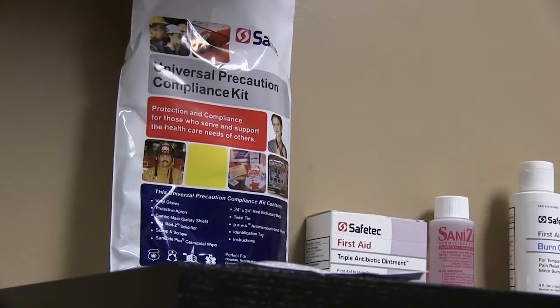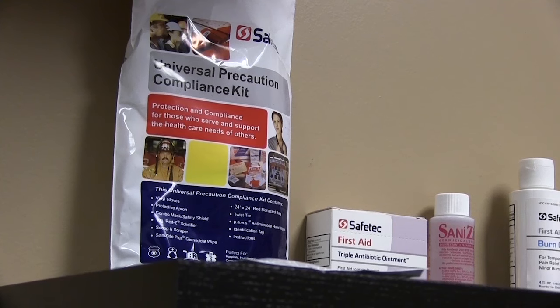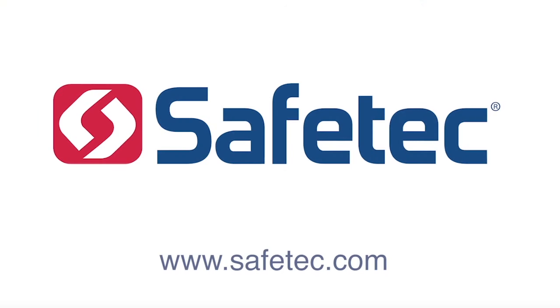Those were the five steps of the Universal Precaution Kit. The kit is designed to help in OSHA standard compliance. To learn more about this or any of our other products, please visit us at www.safetech.com.